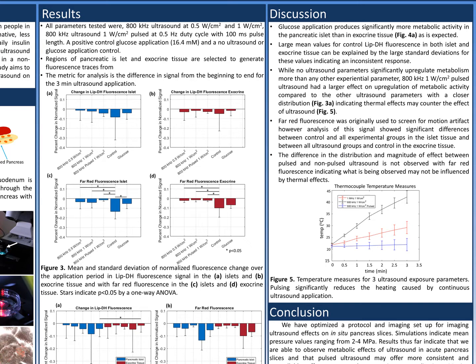One reason that we might not have seen the types of changes that we were expecting is significant thermal effects happening due to our setup. The tissue is in an imaging well, which doesn't have a large volume of liquid inside. So for the 3-minute application period, a lot of the transducer inefficiency is converted to heat. But we can see that with the pulsed ultrasound, the blue line in figure 5, there isn't a lot of additional thermal energy added with these measurements.